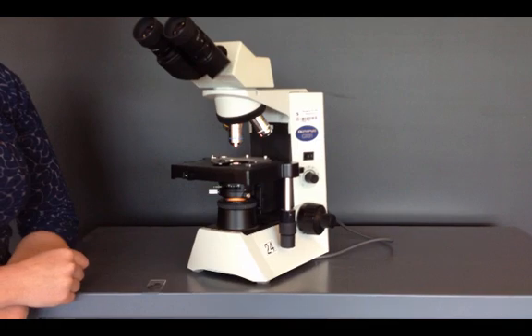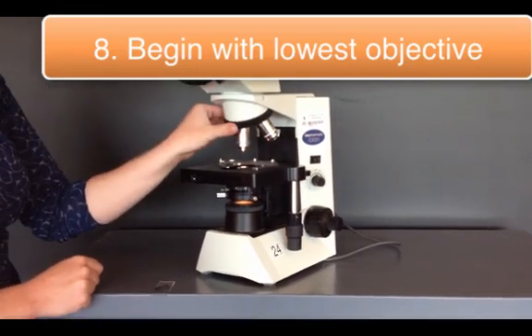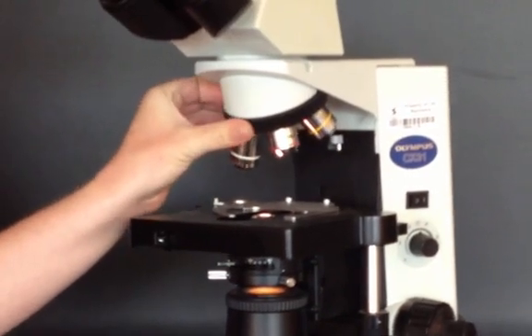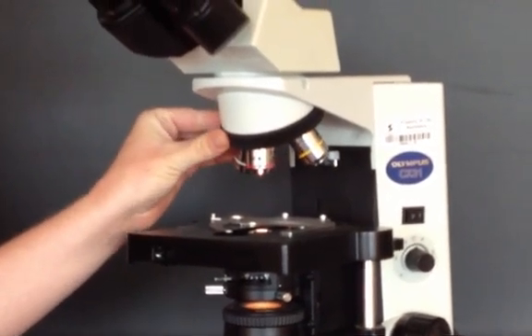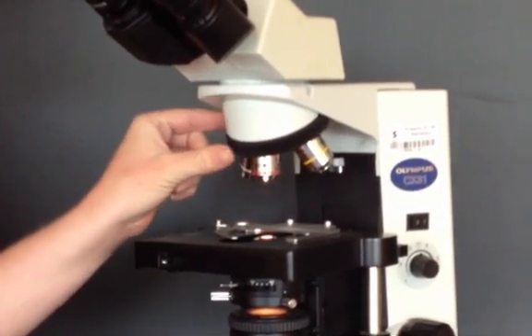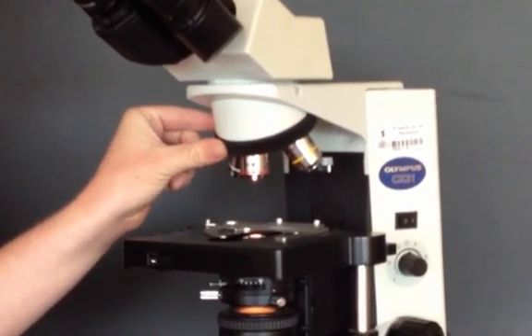Then you're going to turn to your lowest objective. Do so by rotating the objectives here until they click into place. Do not grab the objectives themselves, but instead use the rubber turn knob.